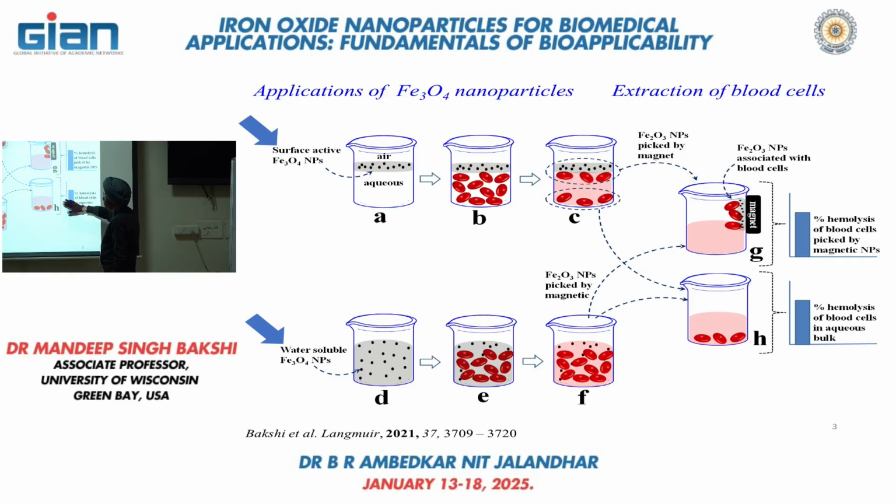hemolysis. So I mean to say that we perform the UV analysis to figure out how many blood cells are being broken while performing this extraction.